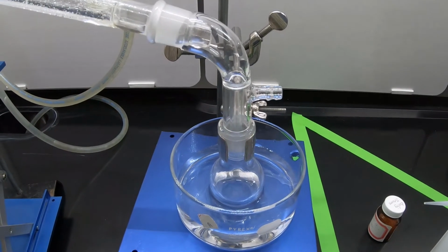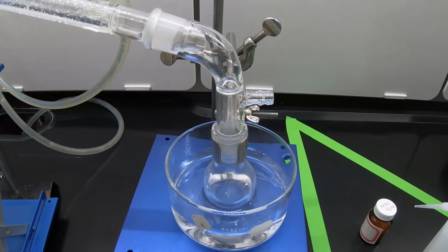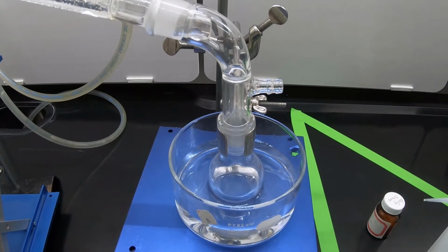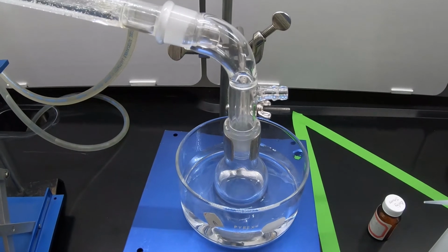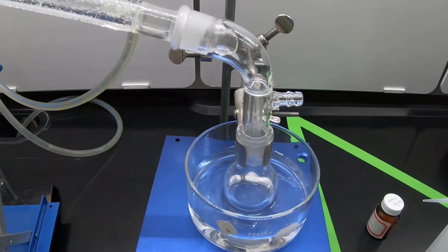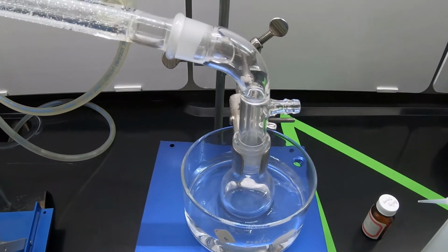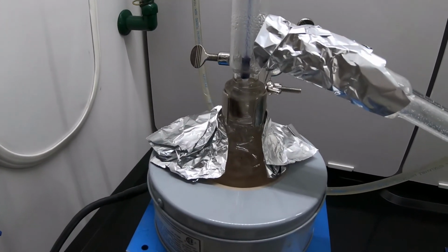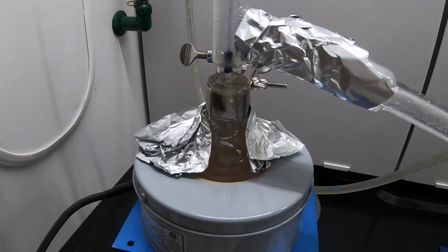Thankfully, we can't smell this, or I can't smell this. I know this stuff smells very, very bad, but keeping things in the fume hood has really worked for us. Right. Reflux is continuing. The tinfoil seems to have done a very good job of keeping the heat in, so that happened very quickly.